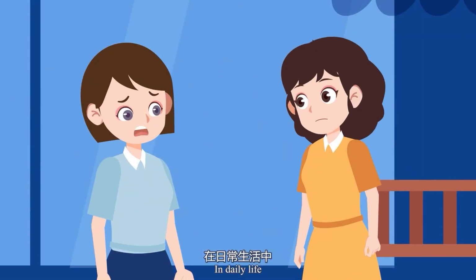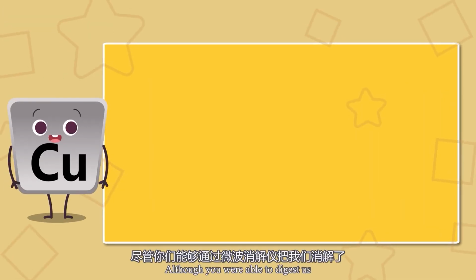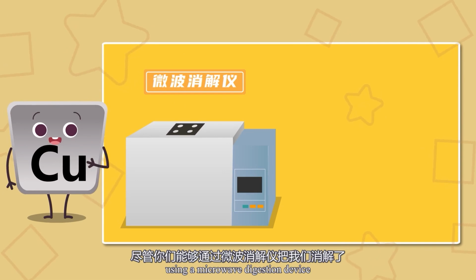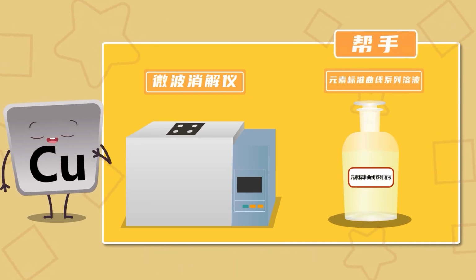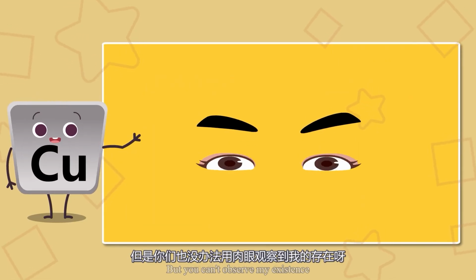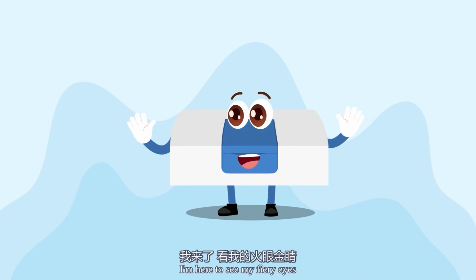In daily life, people turn pale at the mention of me, even though you can digest us using a microwave digestion instrument. We also have the element standard curve series solution as a helpful tool, but you can't observe my existence with your naked eyes either. Don't get too cocky. I am here to see my fiery eyes.